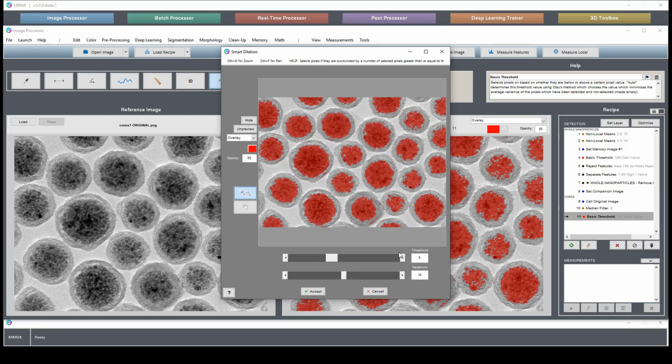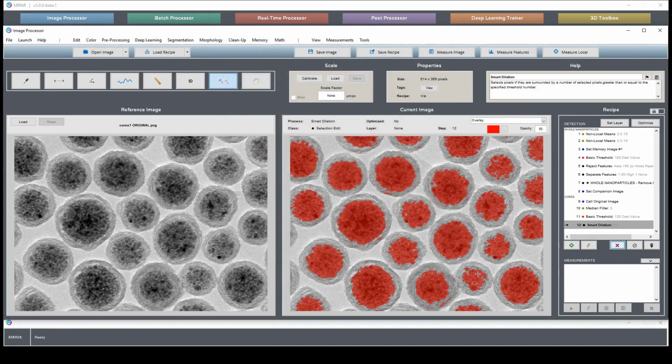So we can set a smart threshold, say, of about 5, looks pretty good here, to fill in some of this without inadvertently connecting things that we don't want to have connected. And we could even go to 4 if we didn't care about these tight boundaries as much. Say if we did 4 with, say, 3 iterations like this. Okay. And that looks pretty good for doing some smoothing without inadvertently joining things that shouldn't be.